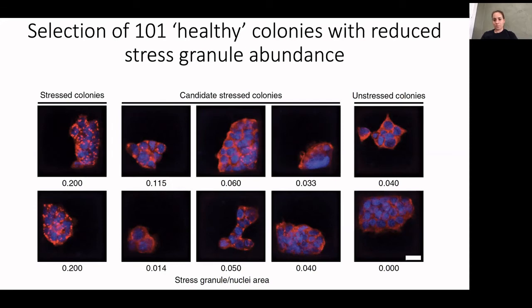Okay, and did you distinguish between the cells, or colonies, that had lower granule to nucleus ratio based on the size of the granules or their number or the density of granules? Yeah, again, that would be another phenotype that we're interested in looking at, but I don't know that the quantification on this platform was high enough to be able to do that. So it gets tricky at this point. We often see, we tried to look at the number of granules, and then again, depending on the particular colonies.